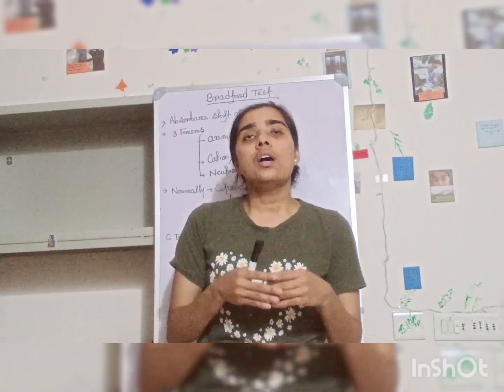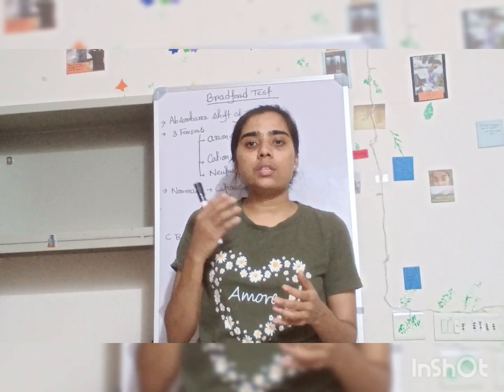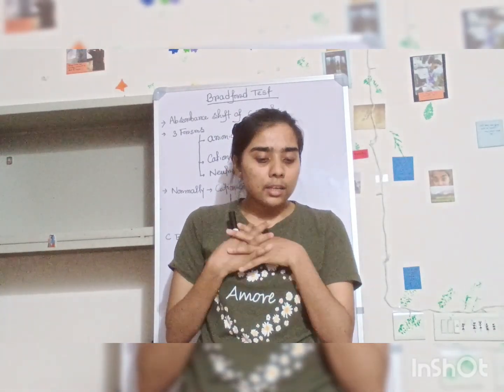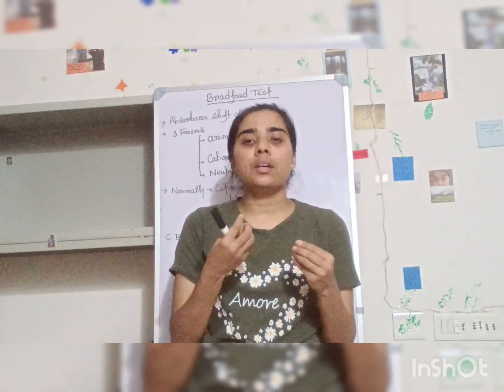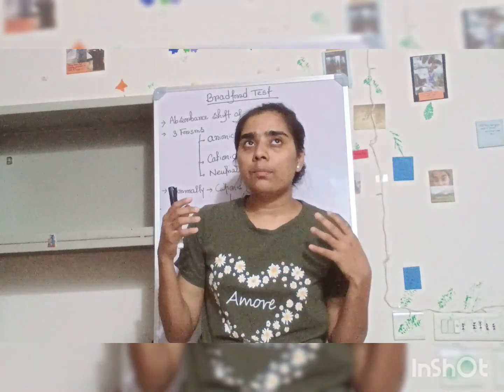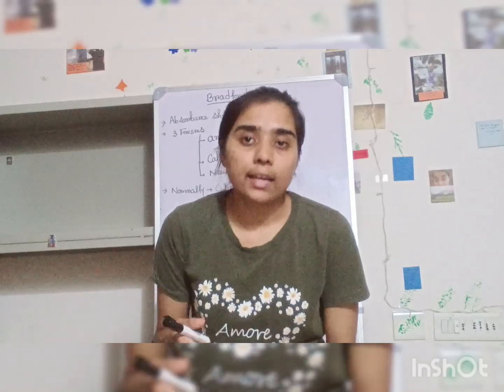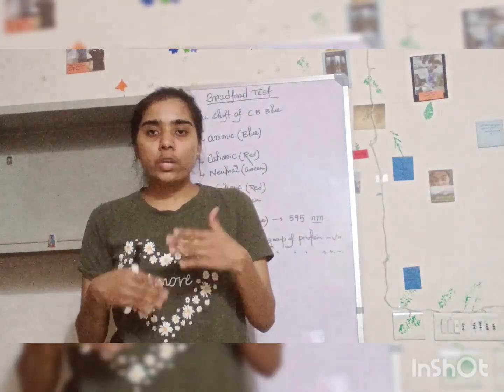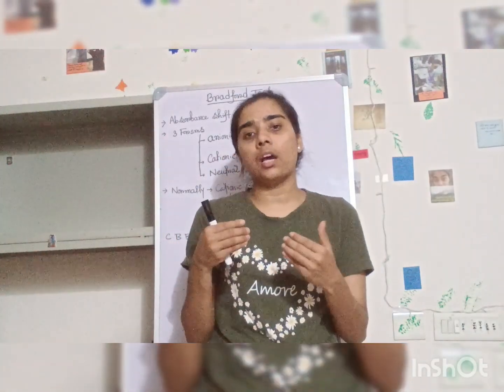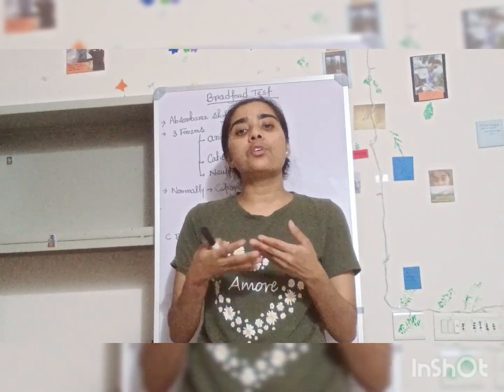Let's say you want to reproduce that crystal for your study. Whenever you want to set up trays for crystallization or any other biochemical assays, you need to know the protein concentration. What is the purified protein concentration in your hand? That is one question. The Bradford assay is one of those assays through which we can detect our protein concentration. So today we'll talk about this Bradford assay, and after this video I will attach one video where I actually demonstrated in the lab how we do the Bradford assay.